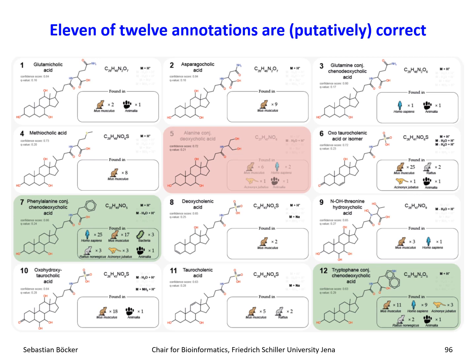We are not totally sure. I mean, there might be some isomeric changes that do not influence fragmentation. So no tandem MS-based method can be sure whether it's this structure or a slightly different one. But up to this point, Louis was sure that these are the correct ones. I think it took him about a day to check all of that manually.